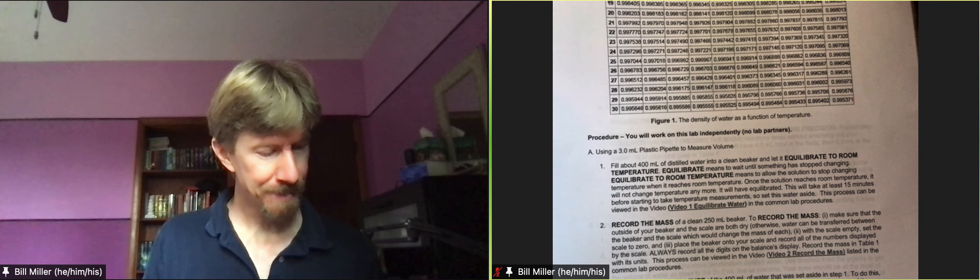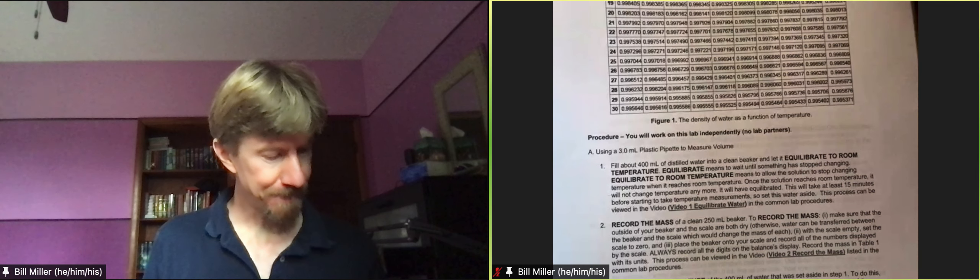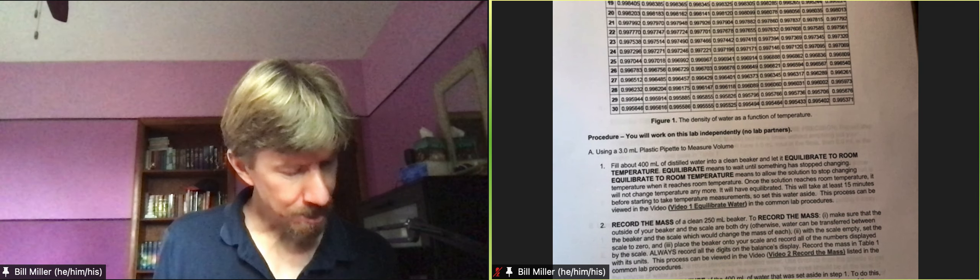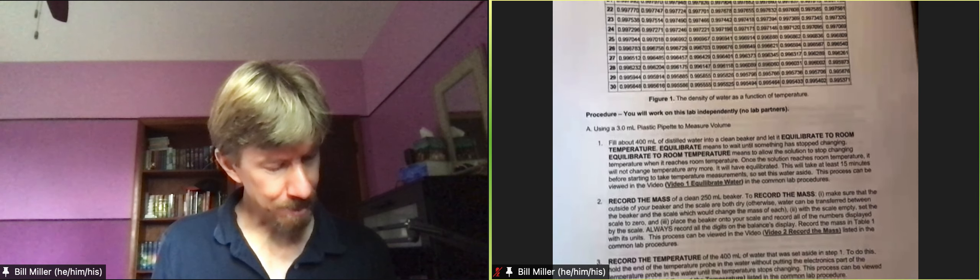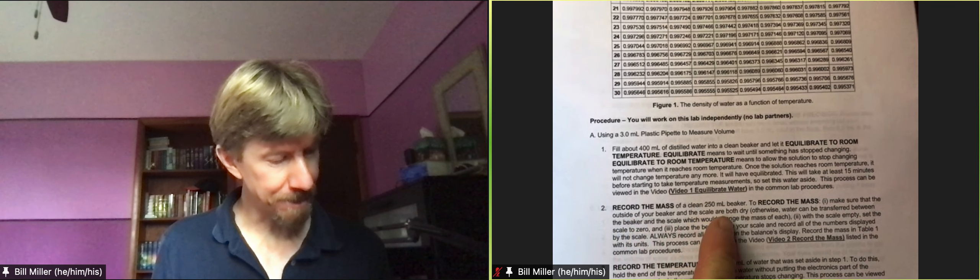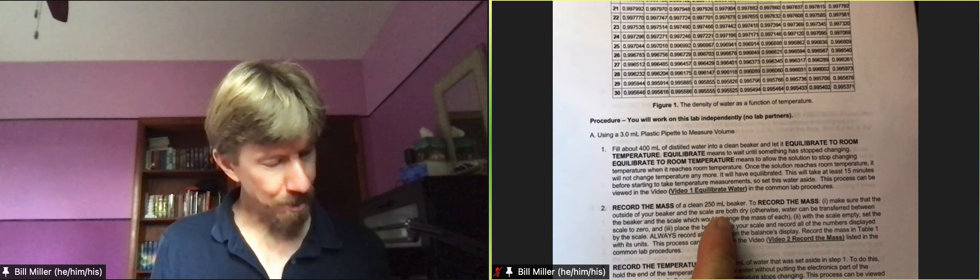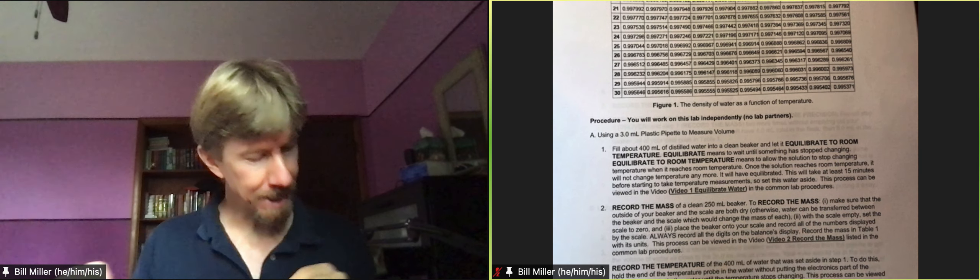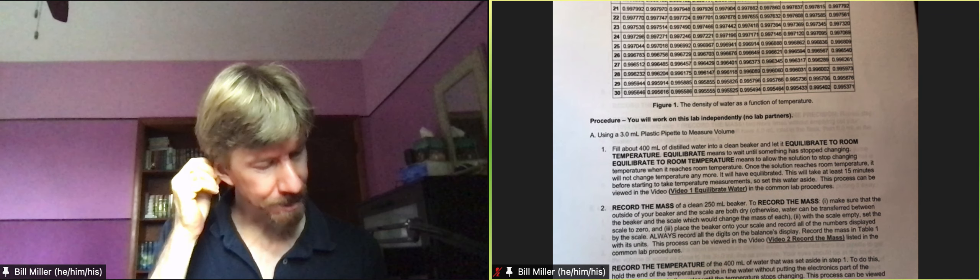Which means let it sit for at least 15 minutes. The equilibrate to room temperature means whatever temperature this comes out of the tap as or out of the distilled water bottle, you just let it sit there so that it comes to the same temperature as the room and we'll be checking the temperature too. Following along, record the mass of a clean 250 milliliter beaker. To record the mass make sure that the outside of your beaker and your scale are both clean and dry.